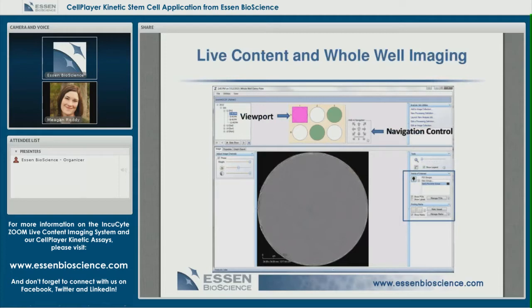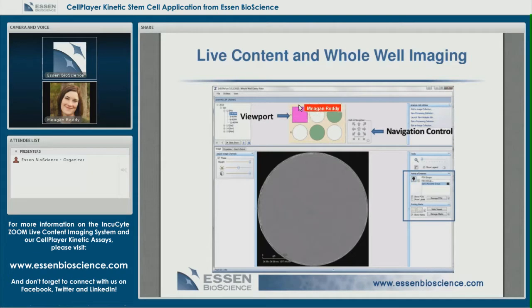To add to the live content imaging approach, we've now added whole well imaging as a new imaging option. When you open the user interface for IncuSite's upcoming software update you'll notice a few additions. The viewport highlights where you are within the well — at this point the entire well is encompassed by a pink box because you're zoomed all the way out and your focus is the whole well itself.